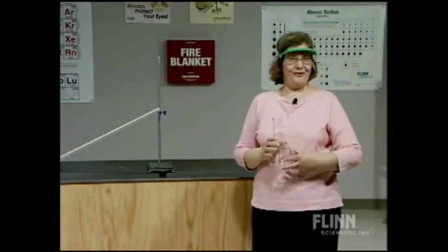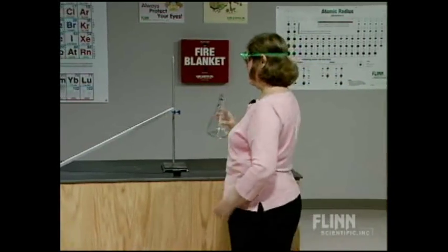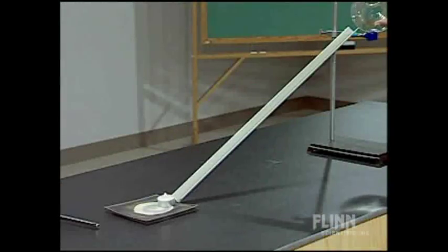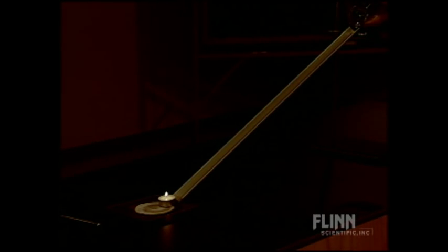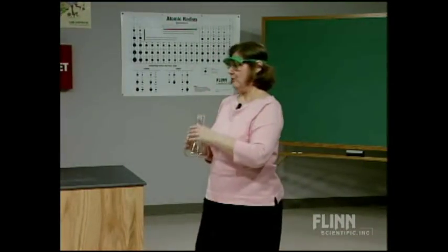Notice that I took the flask away — I only have three milliliters in there. We can demonstrate that again if we take the lights down. When the vapor reaches the candle, the vapor is heavier than air so it flows downhill. I pour the vapor only, being very careful not to pour the liquid as well. And you can see the trail of flames coming up that ramp.